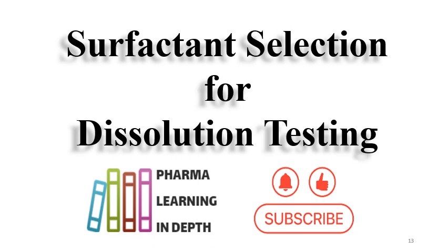So in this video, I have tried to cover the surfactant selection for dissolution testing, what the basics of surfactants are, how these surfactants are selected, and what the challenges are. So I hope you have got good learning from this video.